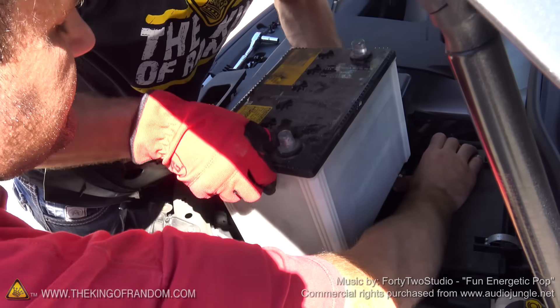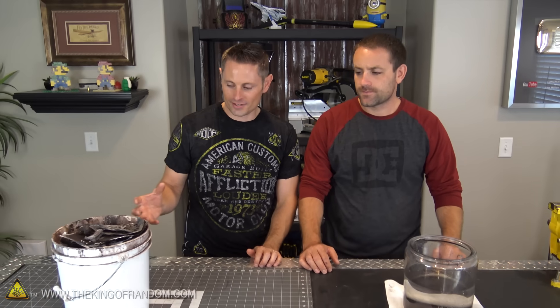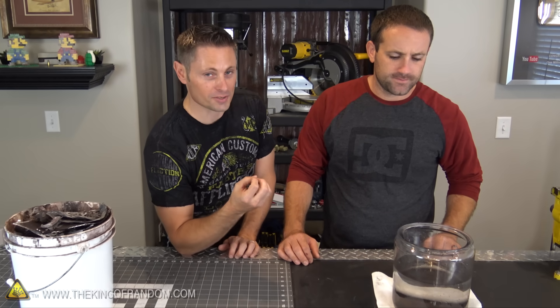Hey guys, welcome back. I'm hanging with my brother again today. Last time we were together, we took the battery right out of my car, cracked it open, and we harvested the lead and the sulfuric acid out of it, which is what we've got here today. But it's really crude and what we want to do is refine this — melt this down and make lead ingots — and this sulfuric acid is really diluted, we want to concentrate that as much as possible.